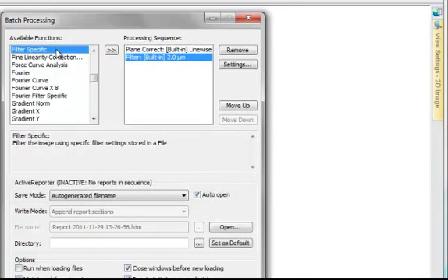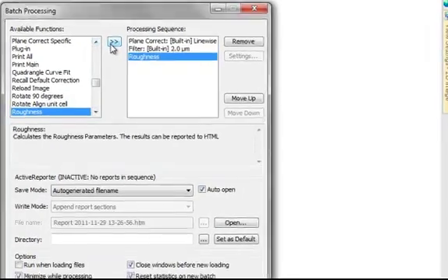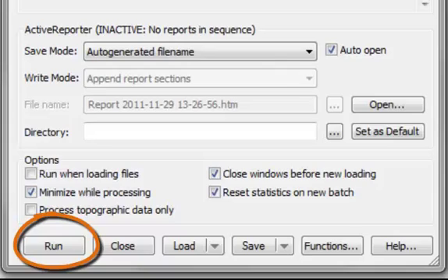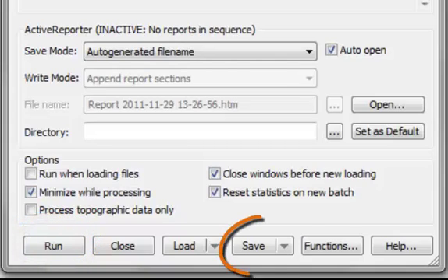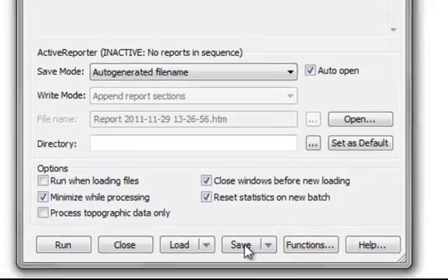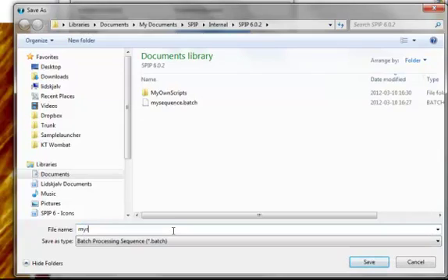Finally, we want to add the roughness analysis. Now, we can run the sequence, or we can save it so we can apply it to other images as well. Let's call it My Roughness.